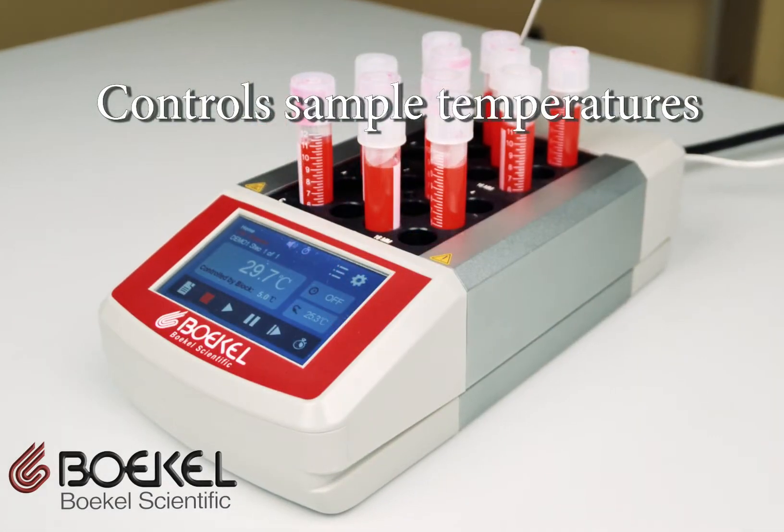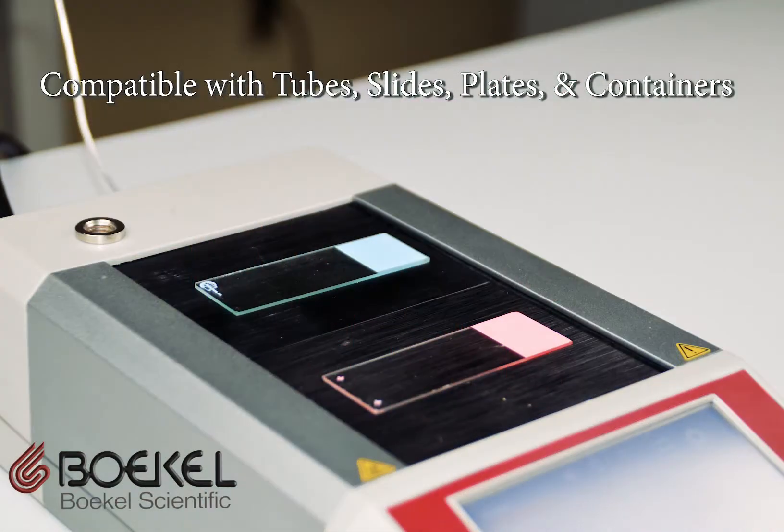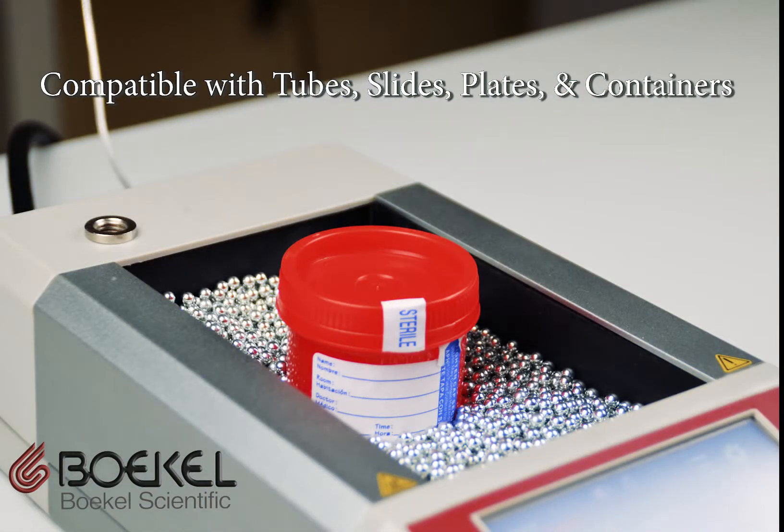They are perfect for controlling and maintaining sample temperatures for a variety of tubes, slides, plates, and containers in medical, research, and veterinary laboratories.